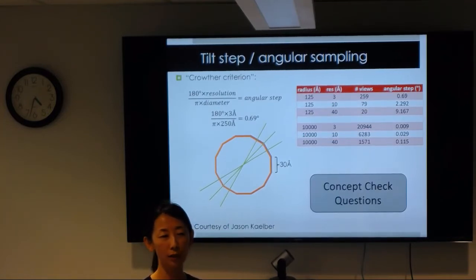If you don't do subtomogram averaging, you just want to look at the object, missing wedge is really going to mess up your view. You might want to try dual axis then; it justifies trying it. But if you want to do subtomogram averaging eventually, why not just collect more particles and then compensate for missing wedge by combining information from more particles? That way, for each particle you have more information in each frame of image, which gives you better alignment, lower error, and then better resolution for each subtomogram. I would recommend doing single axis.